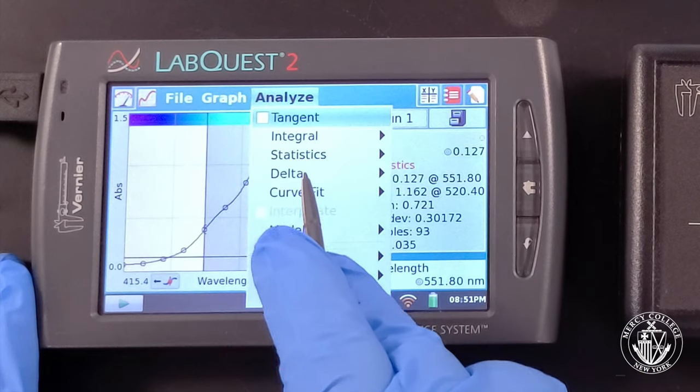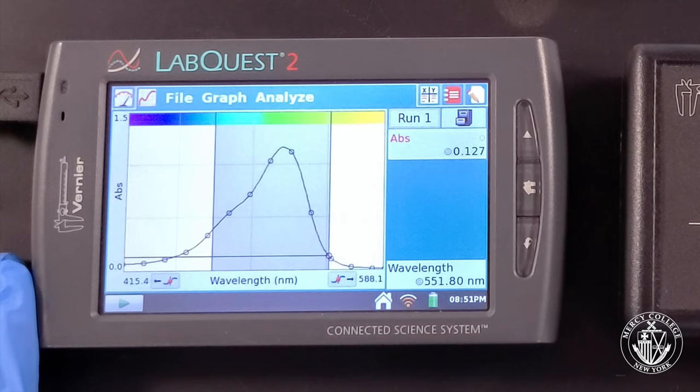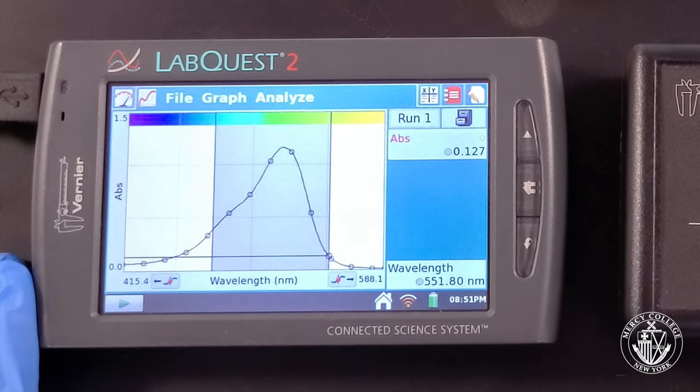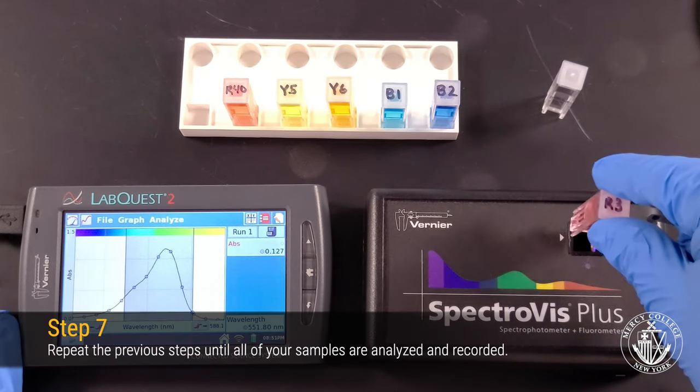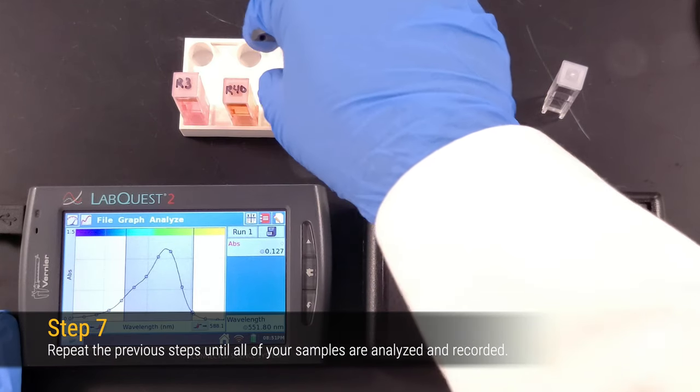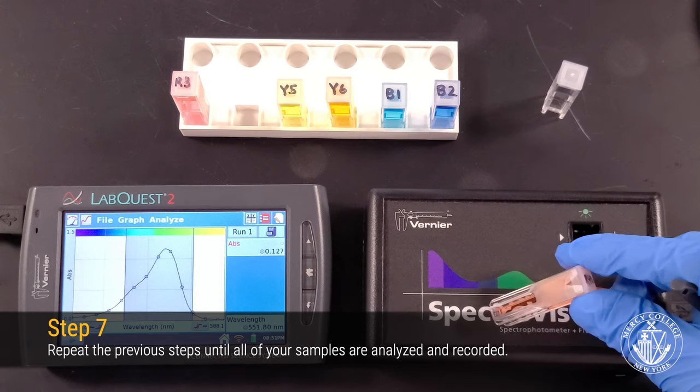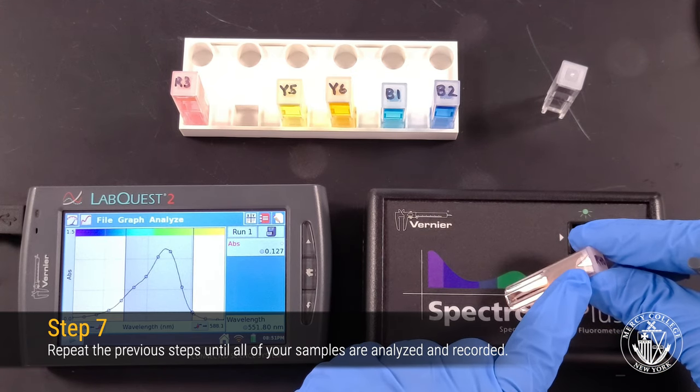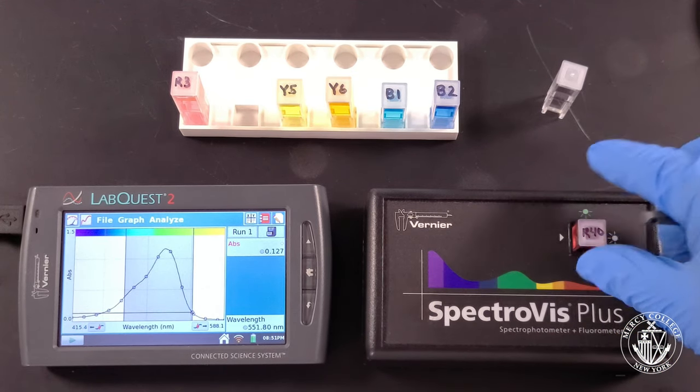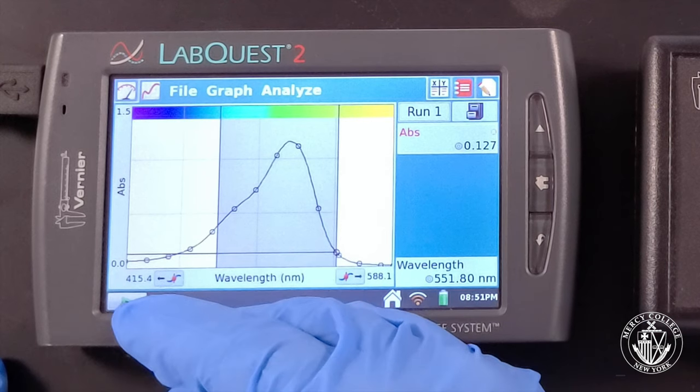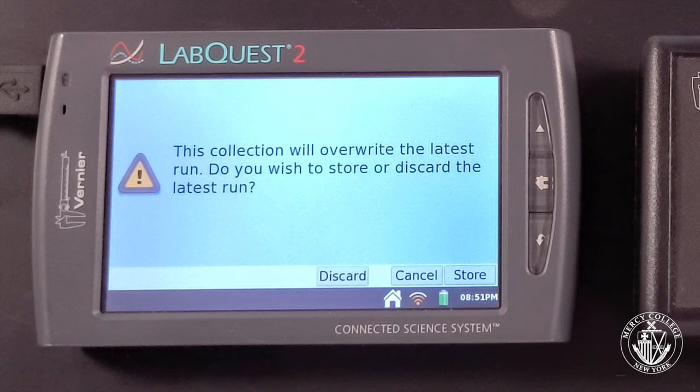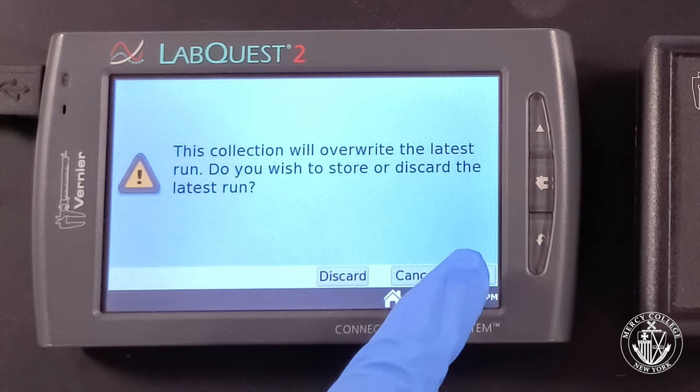Again select Statistics from the Analyze menu to clear the Statistics panel on the right. Remove your dye standard from the spectrophotometer and select another dye standard to analyze. Insert your standard into the spectrophotometer, again making sure the arrow on the cuvette aligns with the arrow on the spectrophotometer. Use the Play button to record your next spectrum. Select Store to save your previous spectrum.